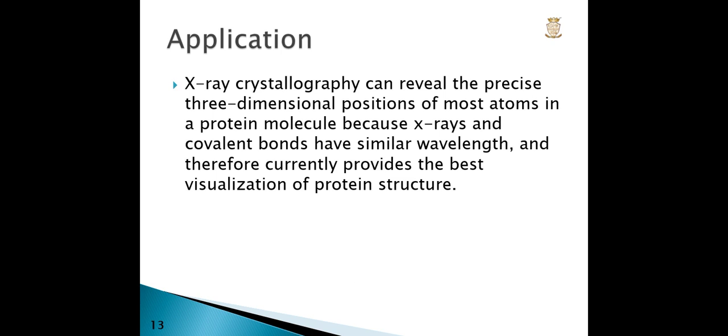Application. X-ray crystallography can reveal the precise three-dimensional positions of most atoms in a protein molecule because X-rays and covalent bonds have a similar wavelength, and therefore it currently provides the best visualization of a protein structure.